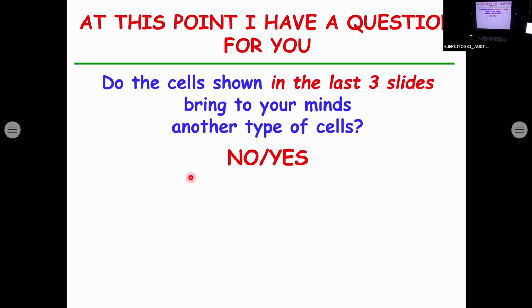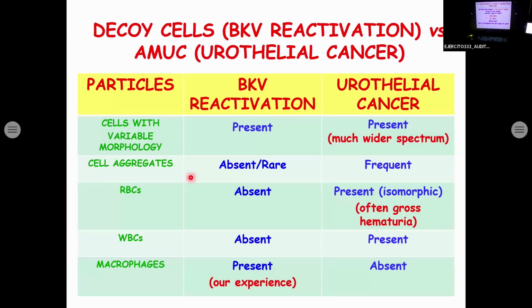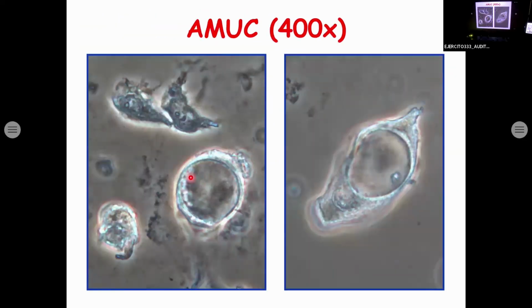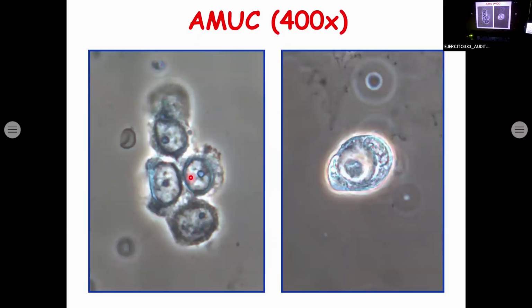The decoy cells, that is true. The decoy cells, which type of decoy cells? No, this is type 1. Type 1, this is type 2, okay?